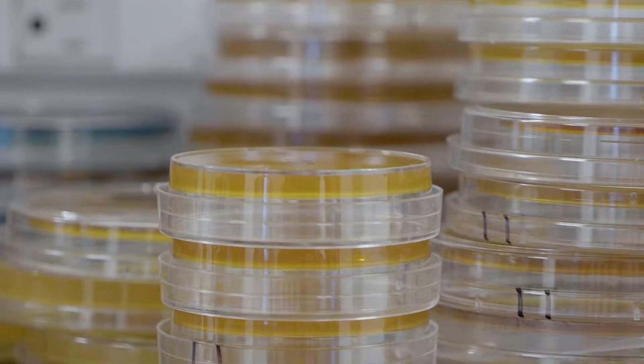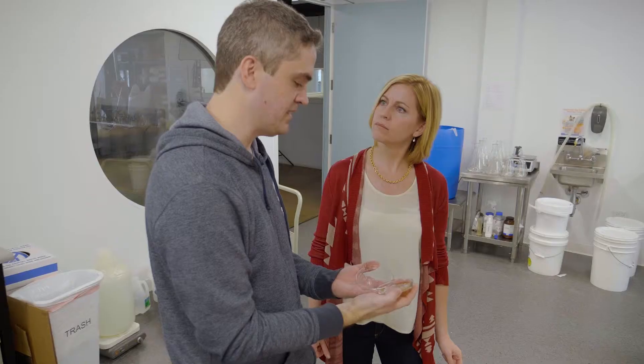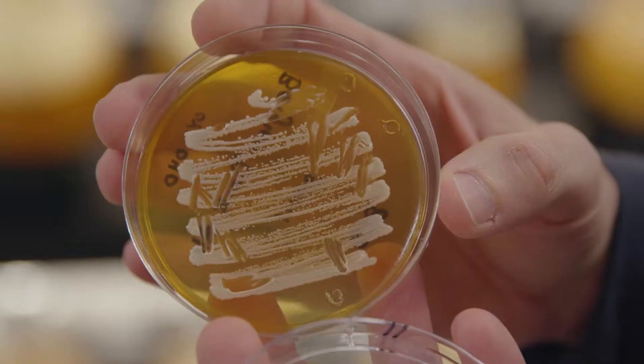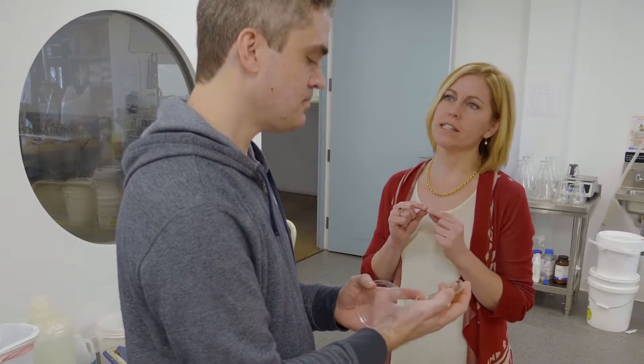And it takes roughly four or five days to get to that maturity point where it's ready to be packaged? There are other species of yeast used in brewing that can take longer than that, but for a typical brewing strain it's five or six days to turn around. So the yeast cells are kind of growing on a medium, like in these little petri dishes, essentially. This plate contains agar, which is like a seaweed derivative that gives you a solid base. Within this is also dissolved a bunch of yeast nutrients. So when you scrape some yeast onto this plate, they'll grow up into these little colonies. Each time you see a little dot on a plate, that is essentially a colony of yeast that arose from a single cell. So how many yeast cells would you estimate are in one of those dots?